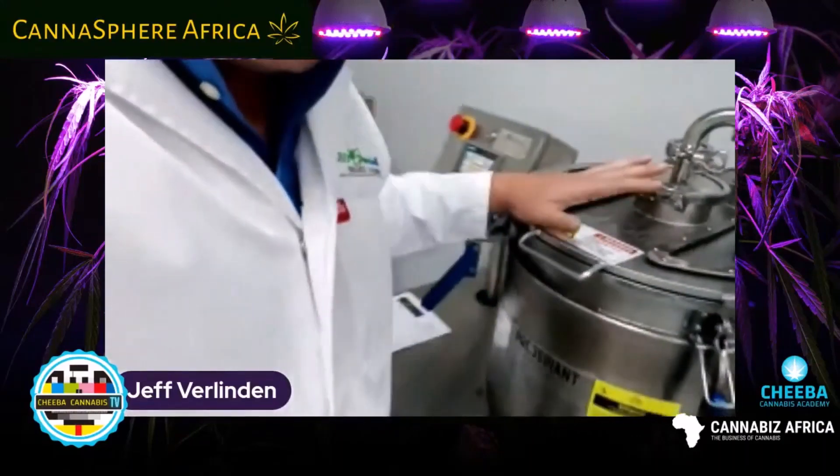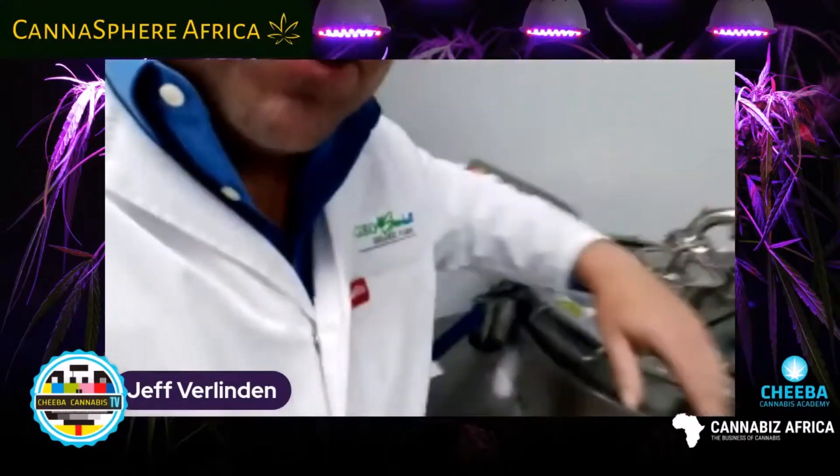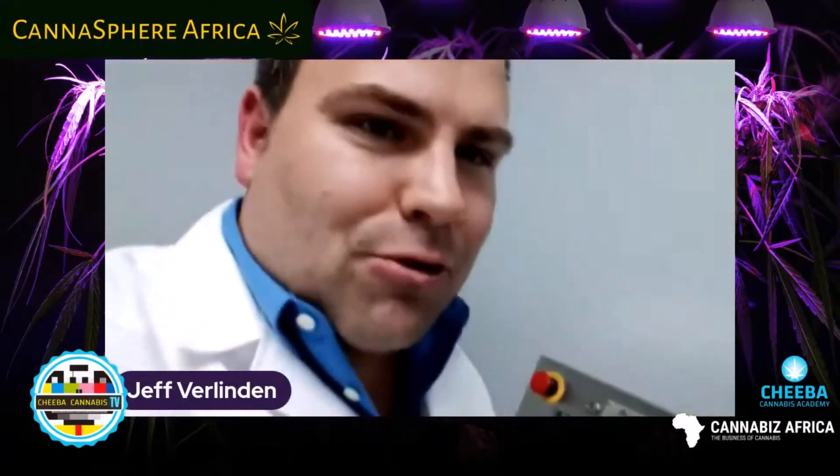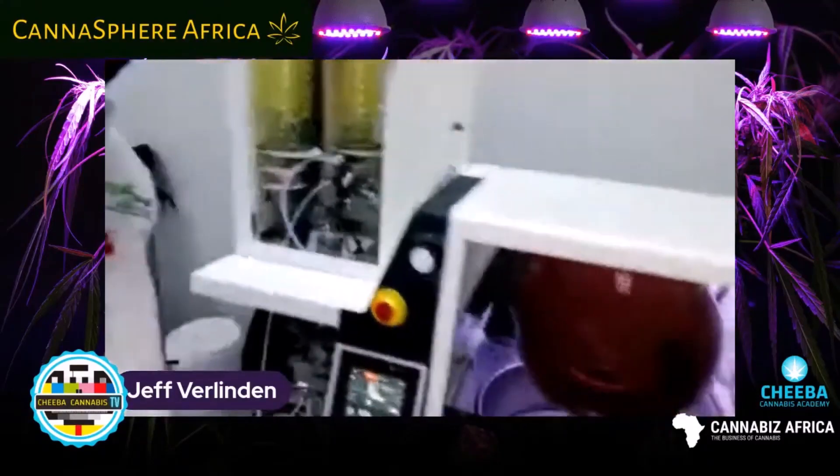Eventually what will happen is you'll drain this into a reservoir tank, and additionally you do a spin dry cycle to ultimately dry it up. From that point, the ethanol will go into a system like this, which is a fully automated rotary evaporator.